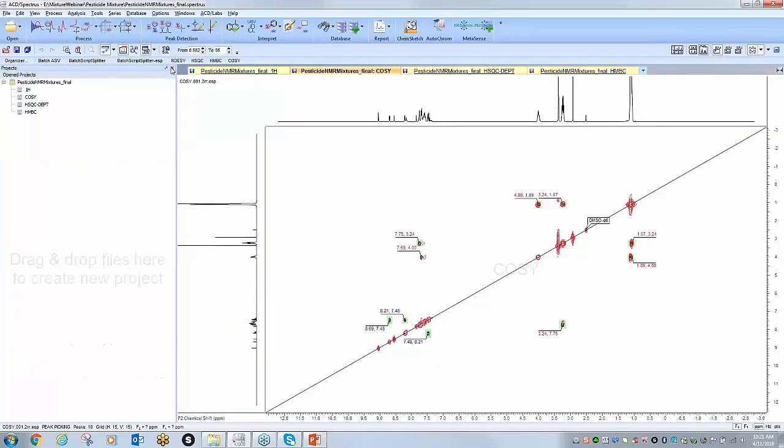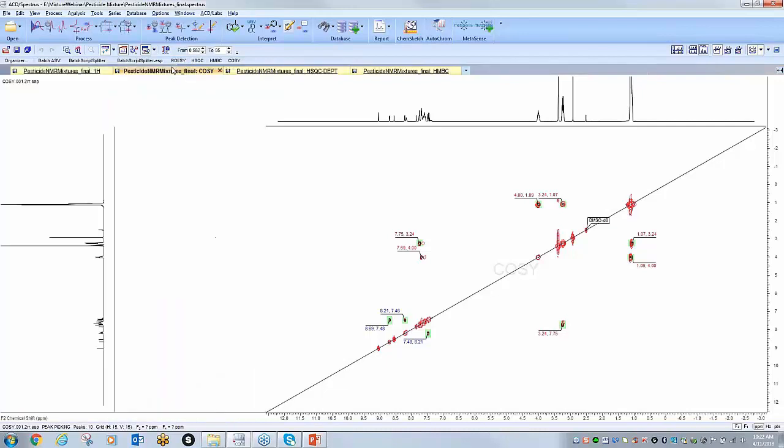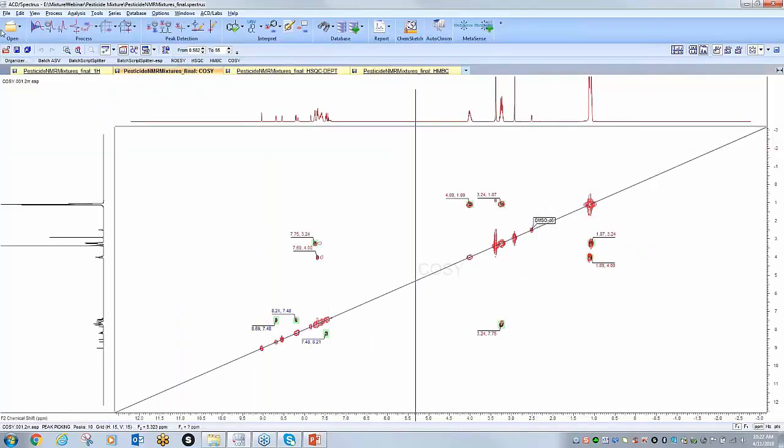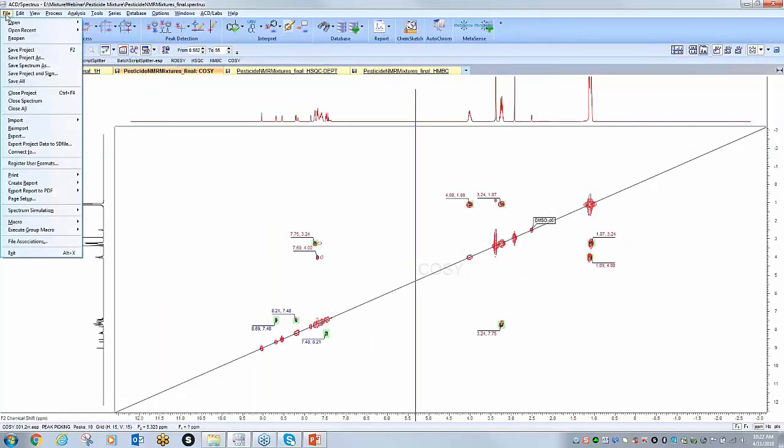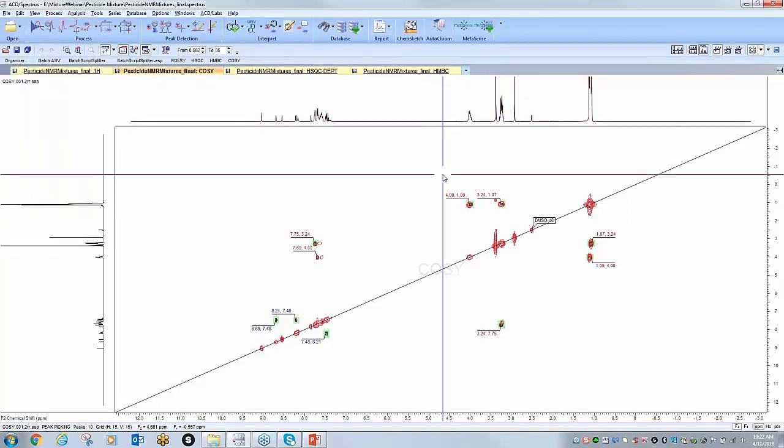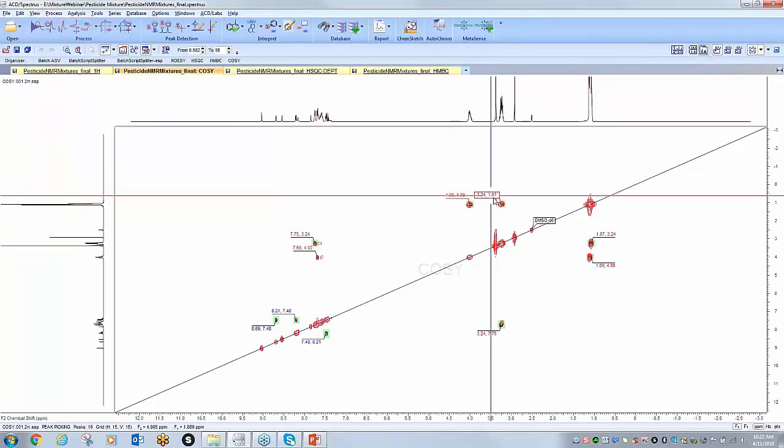Within this project I have a proton, a COSY, an HSQC DEPT, and HMBC. I'm just going to minimize this window for more real estate, and you can see that this is the final solution with all of the different components identified.